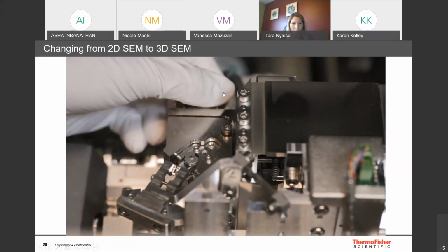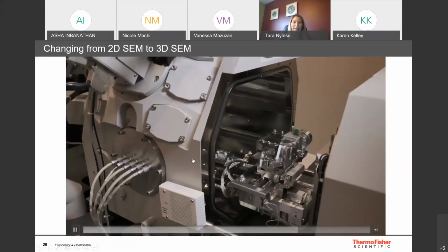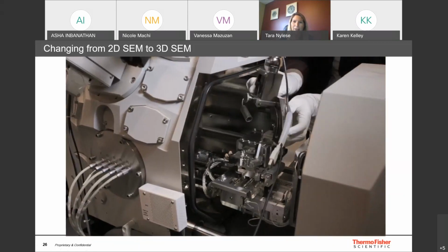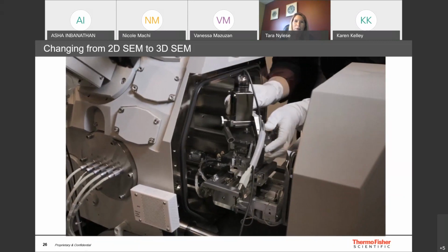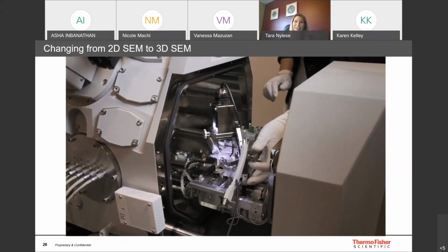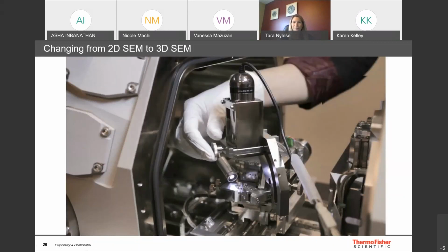So this little dark black area right here, if you could see my screen, is the actual specimen itself, usually a millimeter or so. And then we use cameras to get a rough location, bringing the sample up to the knife so that you don't cut too much nor too little before you actually close the chamber door.